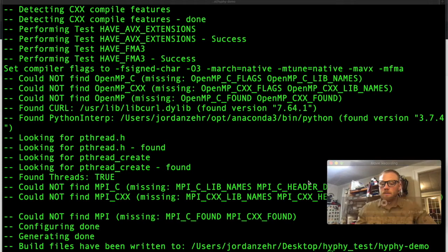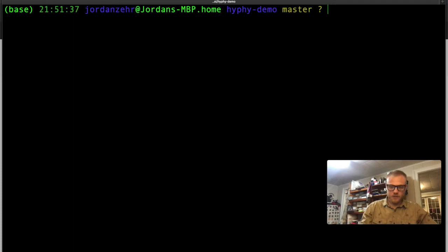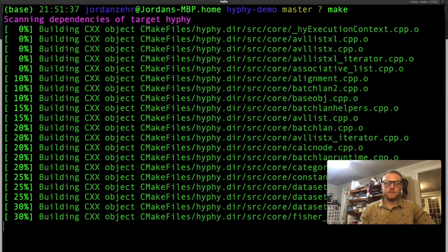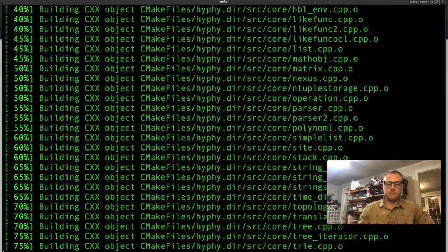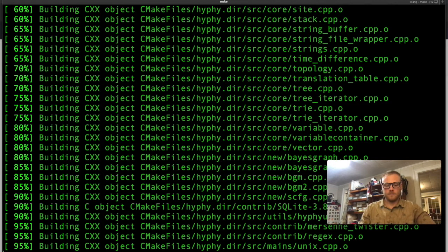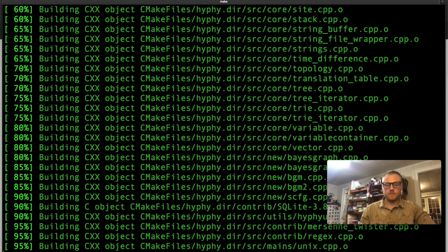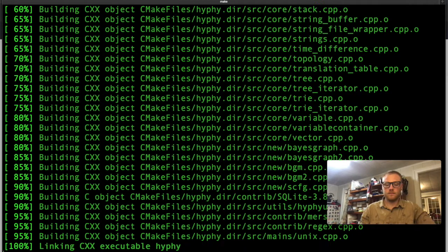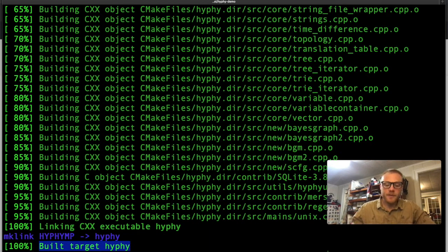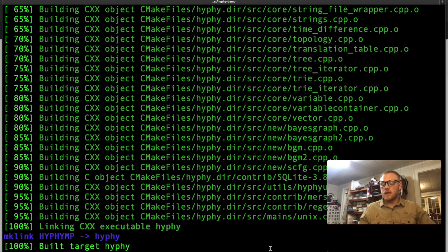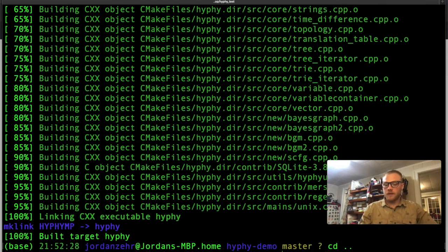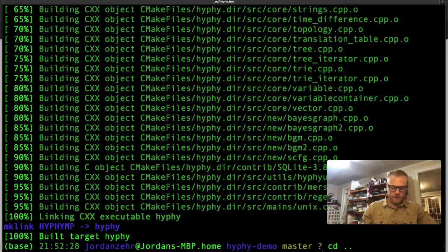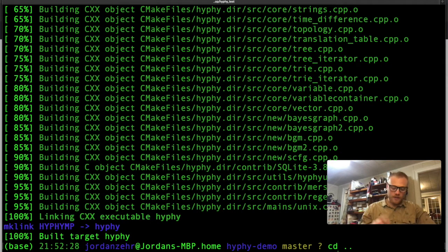So what we're going to do now is just simply type, I'm going to clear my screen and type make. It looks like it says built target HyPhy 100%. So now what we can do is we can actually test to see if we can use HyPhy. So what we need to do is go back one directory and simply type HyPhy demo. This is the directory that we cloned into and the target that we want is HyPhy.